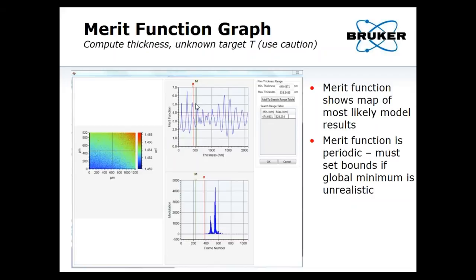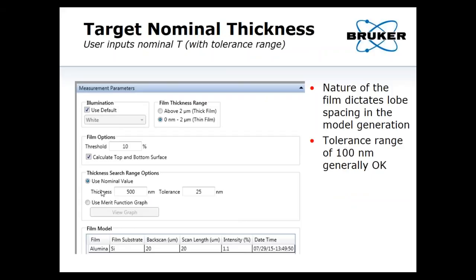This is what the merit function actually looks like. You're trying to find the minimum — there's a periodic or modular result, but there's an overall minimum. Sometimes that minimum is unrealistic relative to your sample. Here the global minimum is up by 1.5 microns, whereas a more reasonable answer is closer to about 400 nanometers. You can bound this to throw away physically non-relevant results. Setting the nominal value is just one click — nominal value and tolerance.